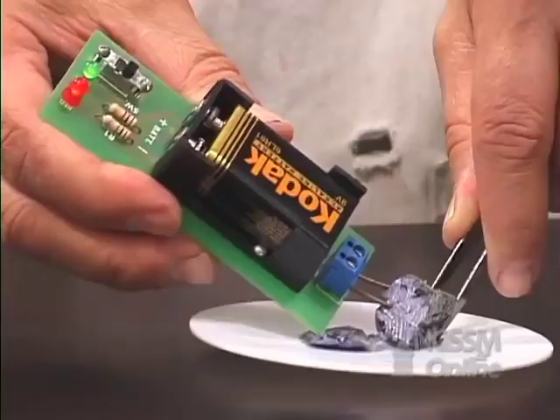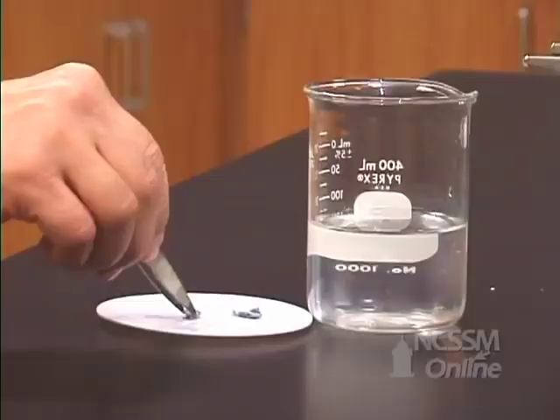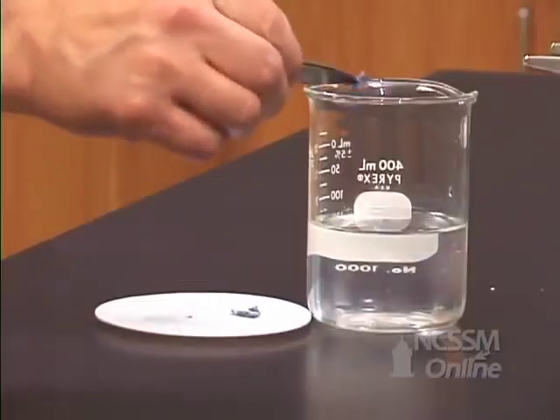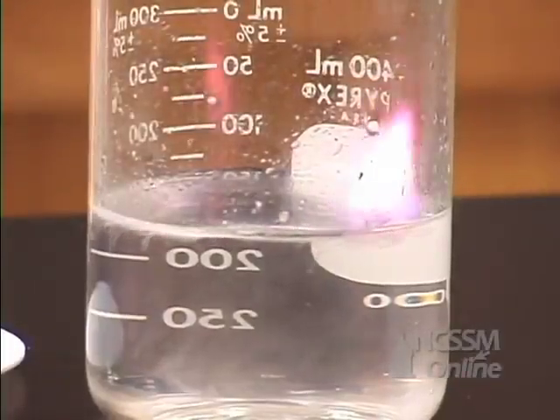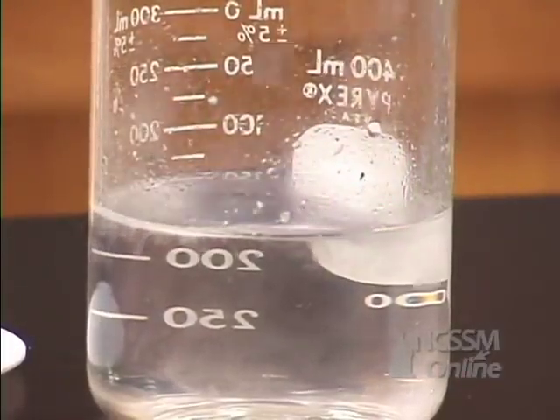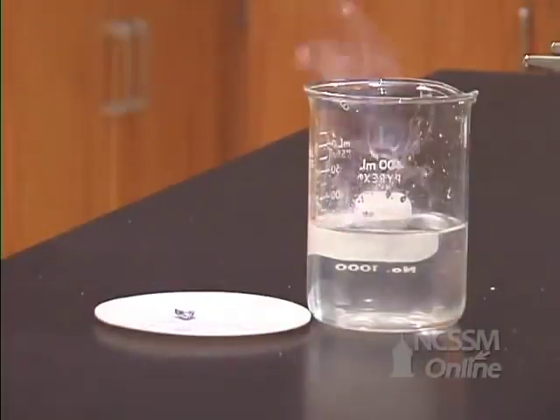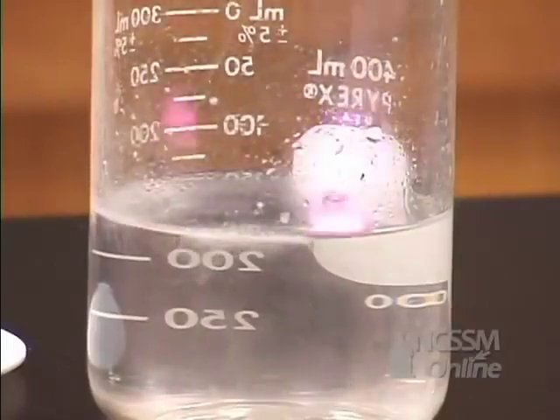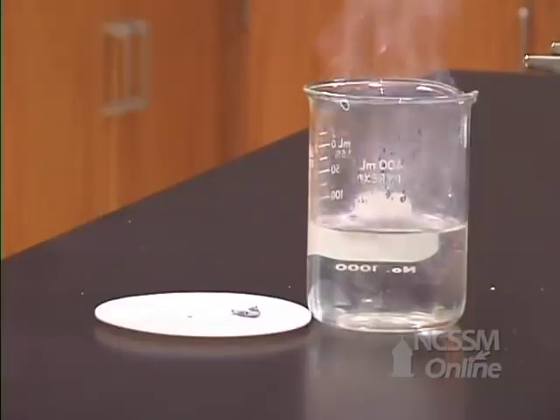The potassium is a metal and is an excellent conductor of electricity. If we add a piece of potassium metal to water, we see that it reacts much more rapidly with the water than sodium. As you go down the column, the ionization energy decreases and the metal reactivity increases. The reaction is very exothermic and the hydrogen that is produced ignites.